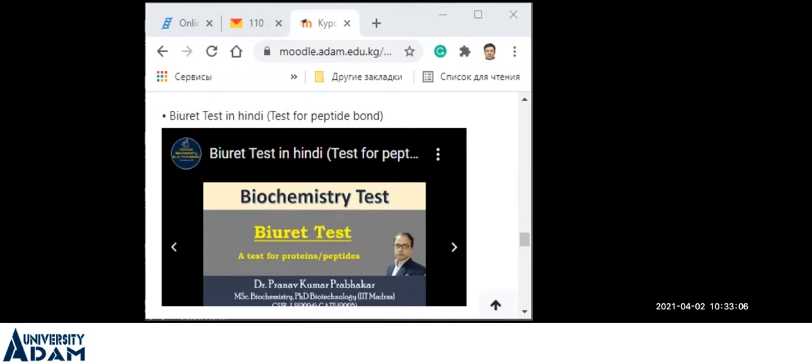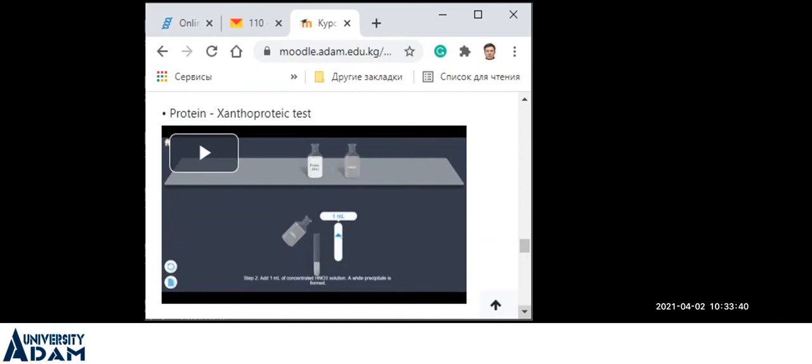Okay. Any questions? Okay, I recommend you see some additional videos about some other tests. This test will be named xanthoproteic test. And we can start from this.